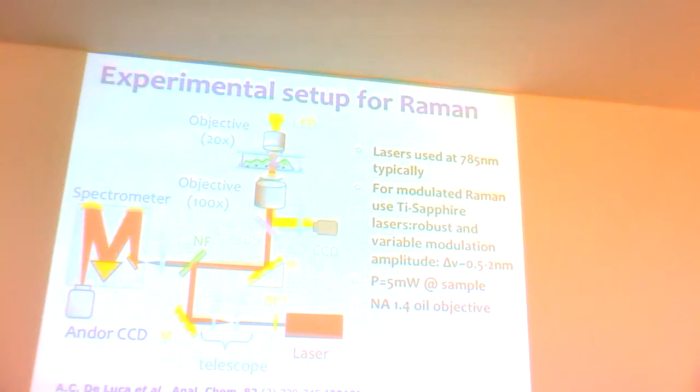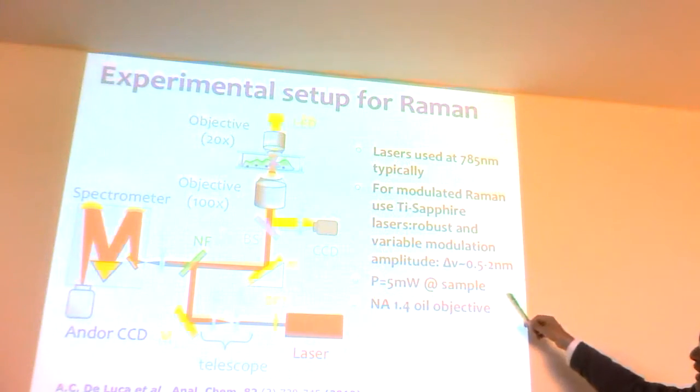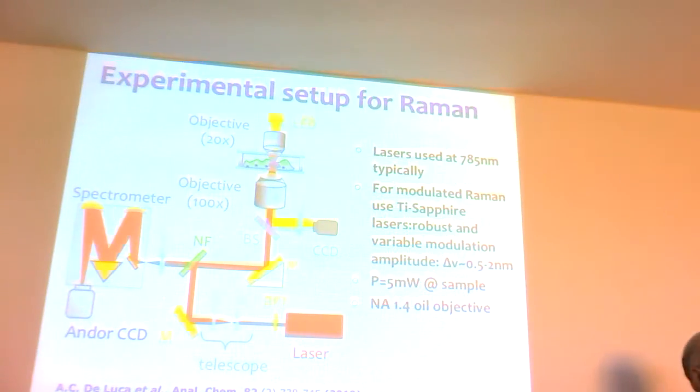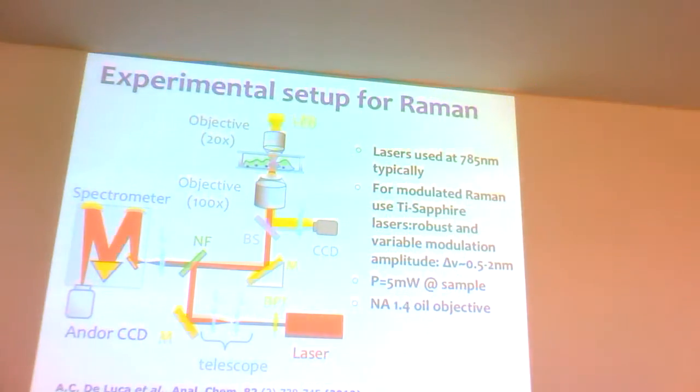So this is a very simple trick, but it's proved amazingly powerful. It's actually commercialized now this year, of something that we did here. But I'll just tell you about what you would do for that. The numerical aperture and all the optical considerations are the same as Colin delineated earlier, depending on what axial and spatial resolution you want. So the volume of excitation matters, though, quite heavily in Raman.